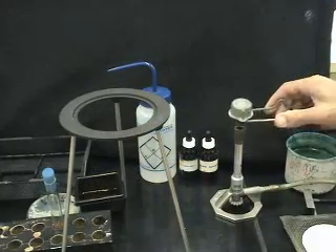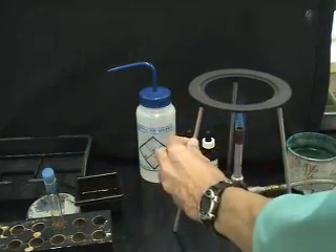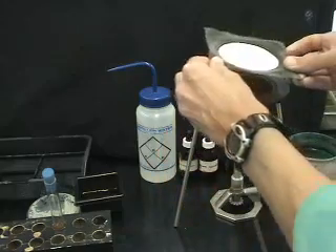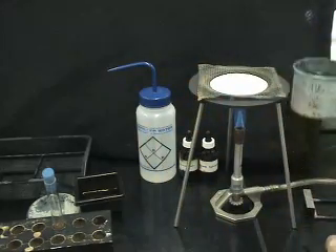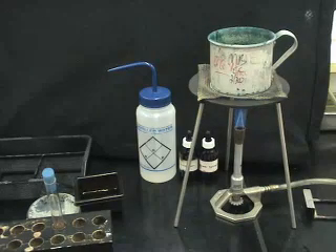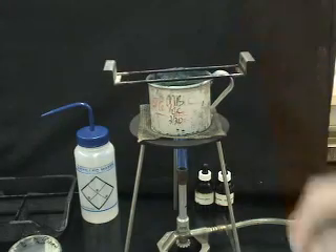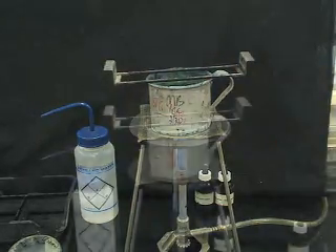When doing an endospore stain, a water bath has to be set up. Here at UW-Madison, we find it useful to just set up a Bunsen burner and a heating plate burner, and on top of it, put a simple metal or aluminum cup. It is important to let the water bath get to a high temperature. Steam should be rising from the water bath before you start the malachite green stain.